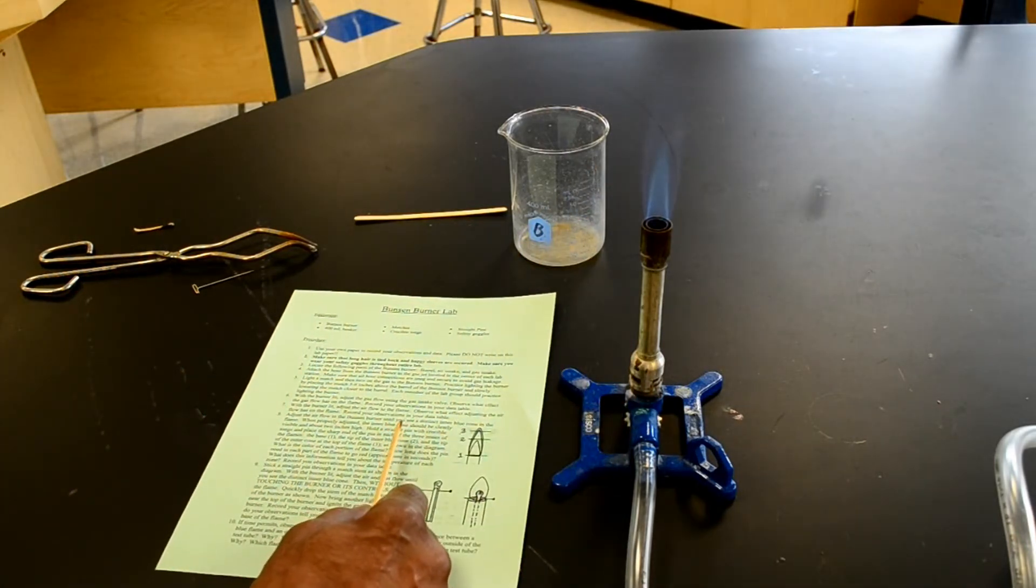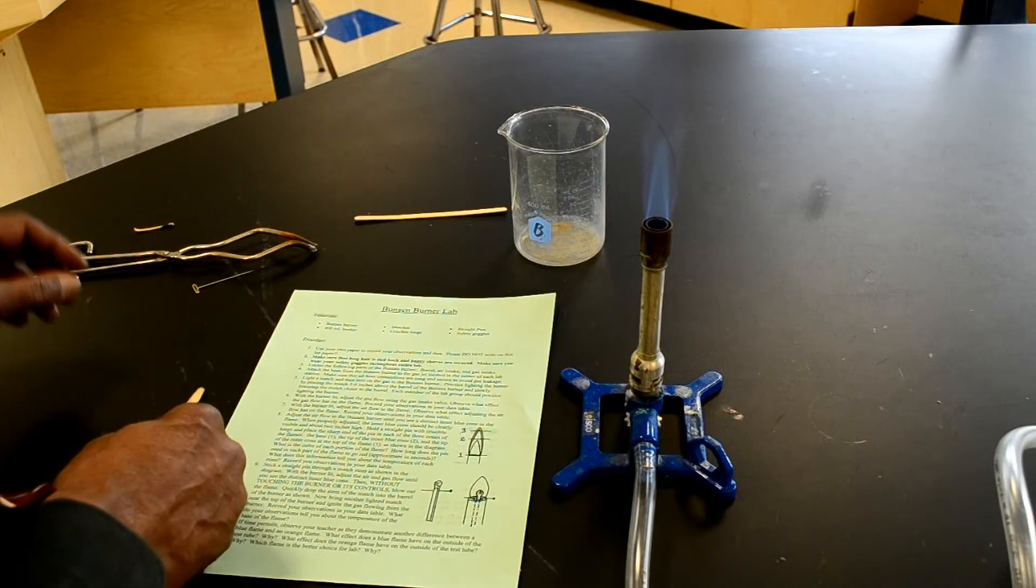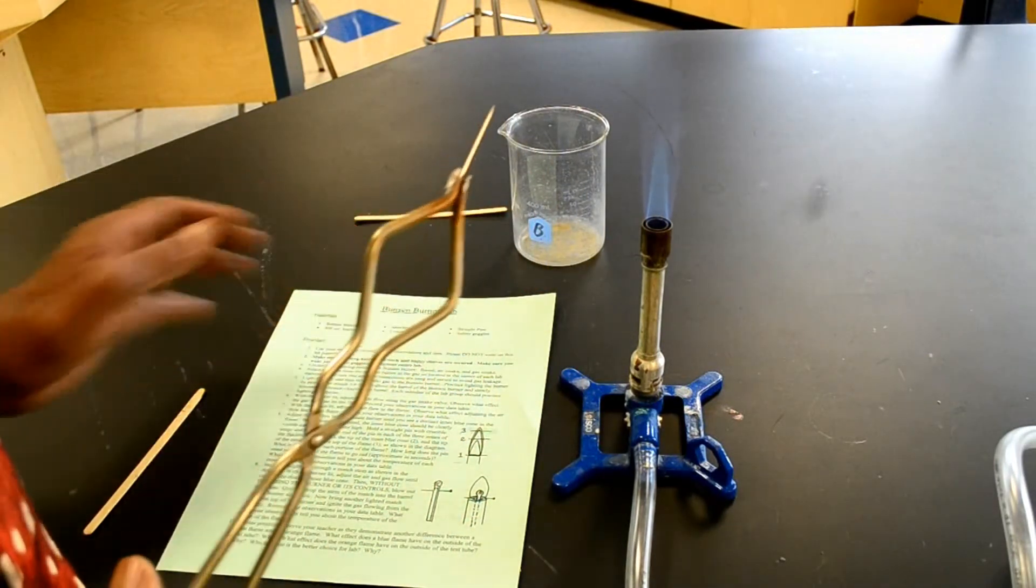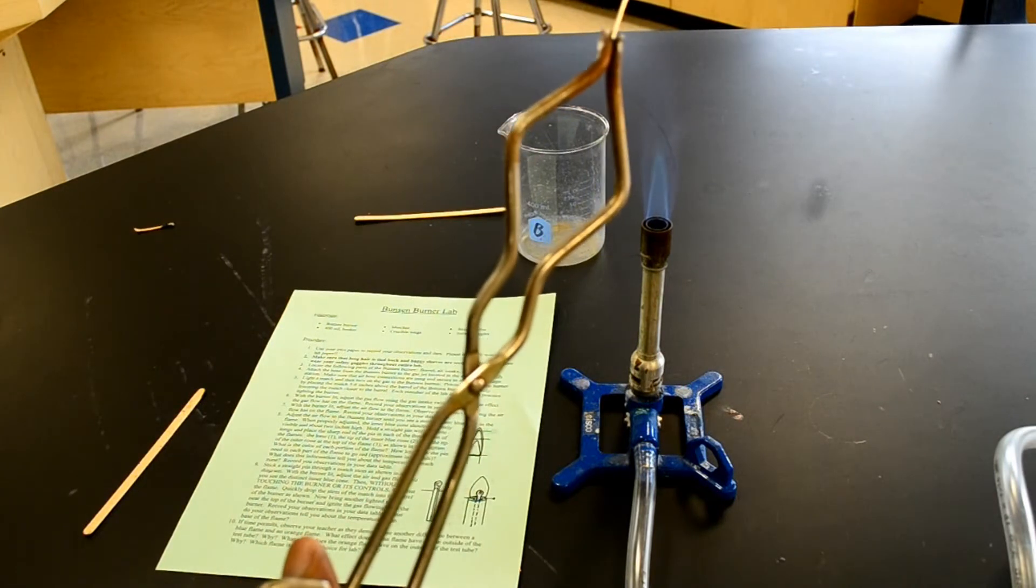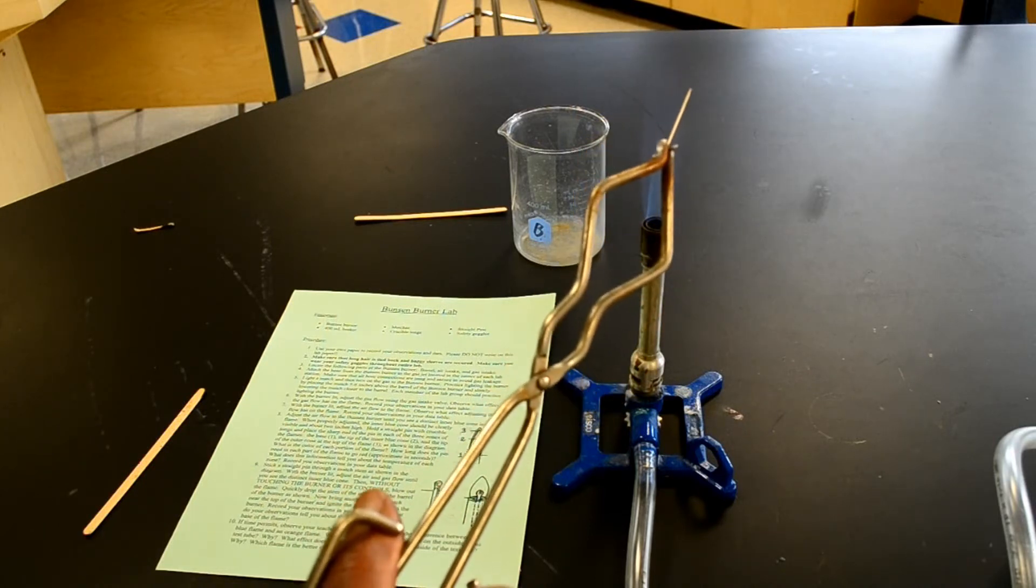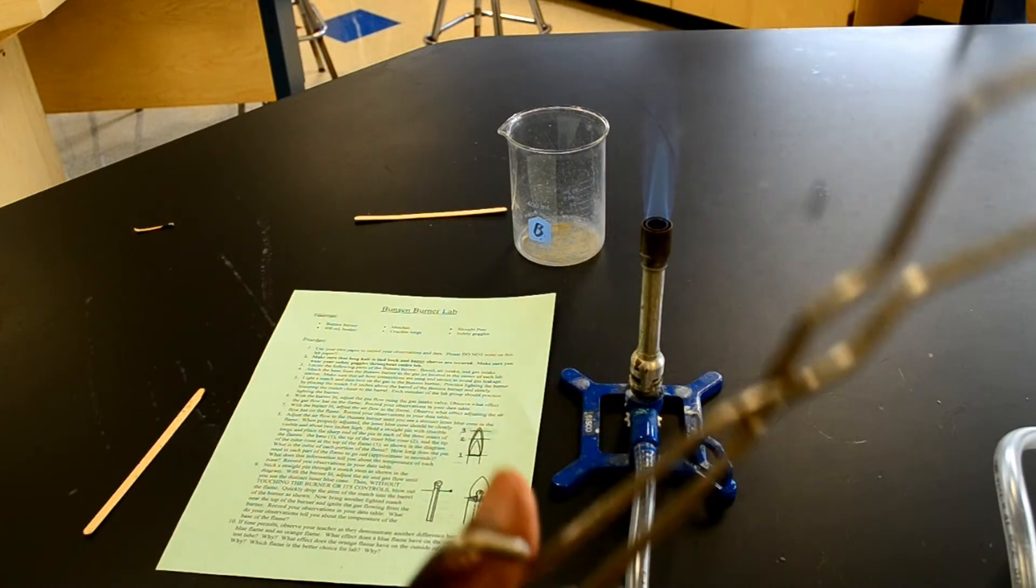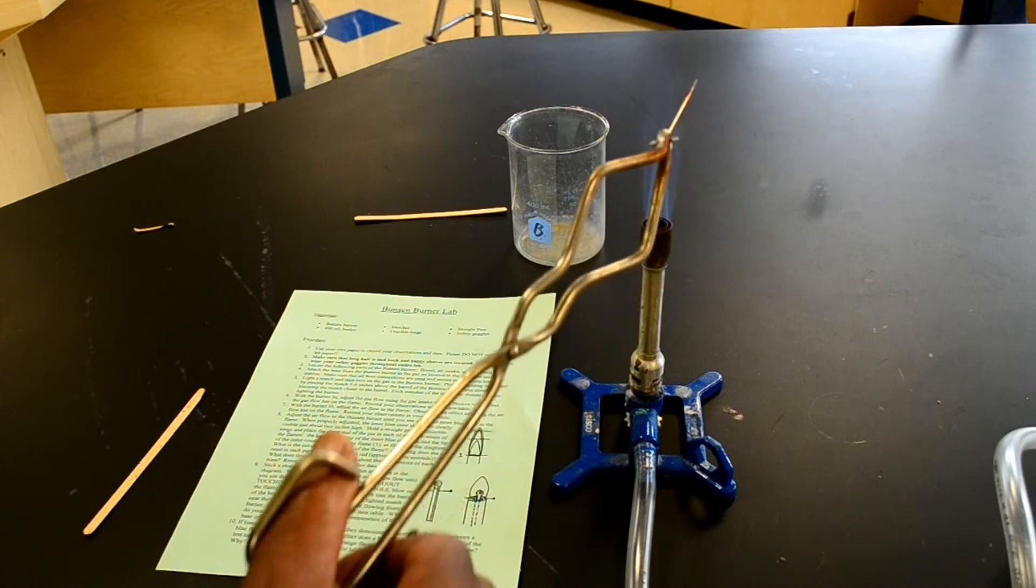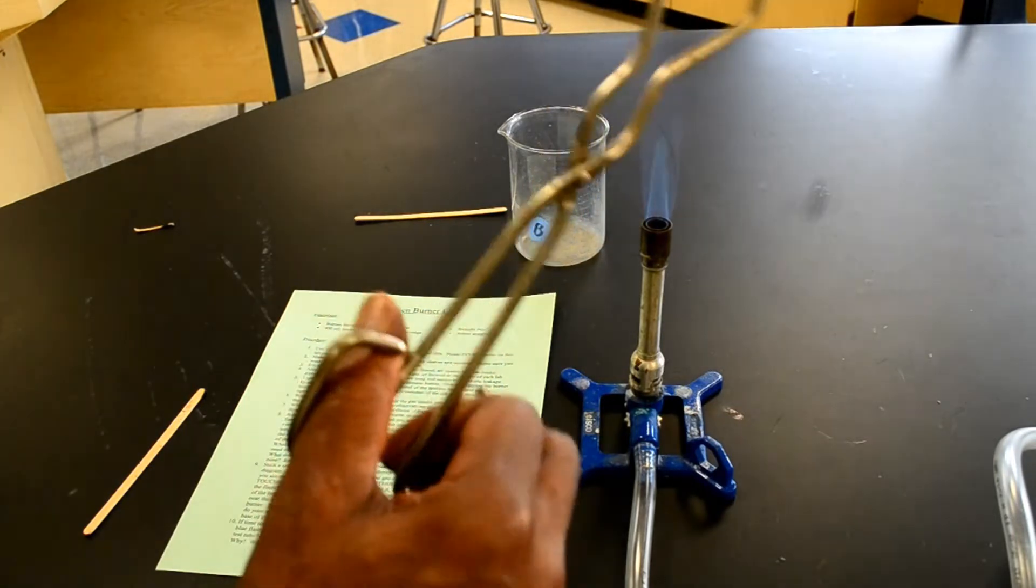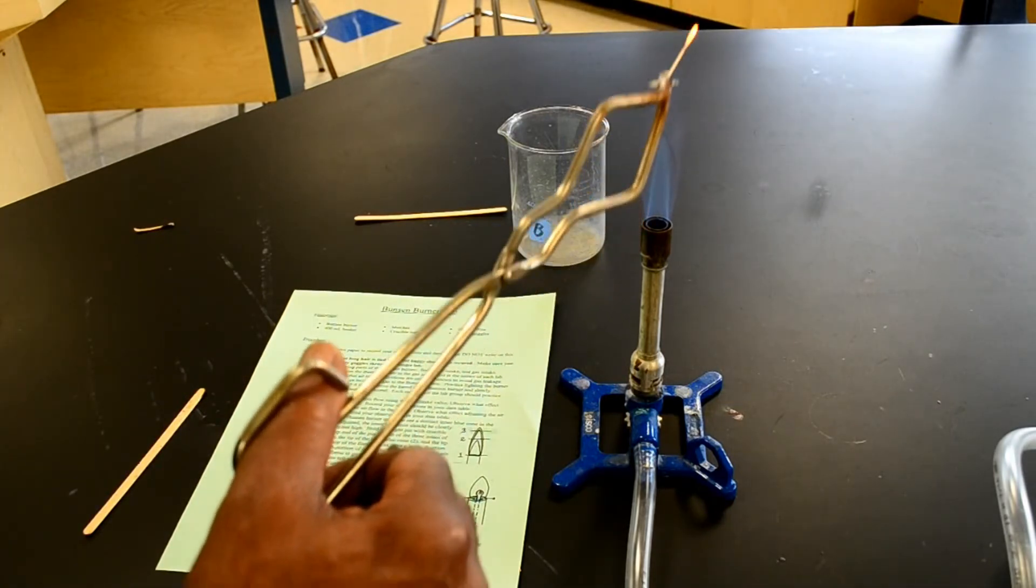Hold a straight pin with crucible tongs and place the sharp end of the pin in the three zones of the flame. Crucible tongs here. Pin here. I'm going to take the crucible tongs. First, I'm going to place it in the base. The base is there. Then I'm going to place it in the tip of the inner cone. And you can see it's getting really red now, so that must be the hot part. The hottest part of the flame so far is the tip of the inner cone and then the tip of the outer cone. That's the outer cone where it gets red again, but the tip of the outer cone is not as hot as the tip of the inner cone.